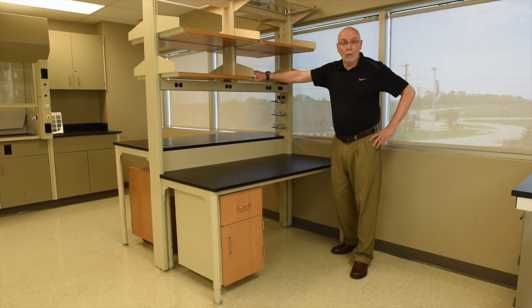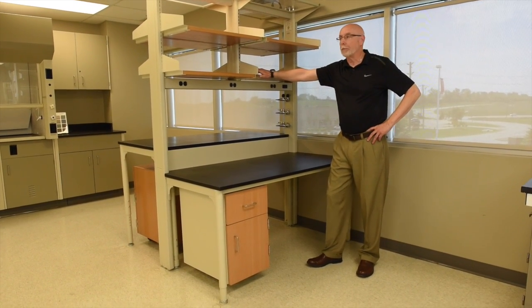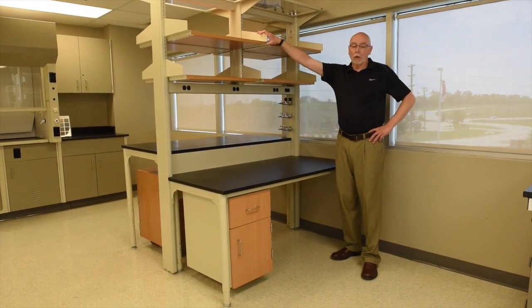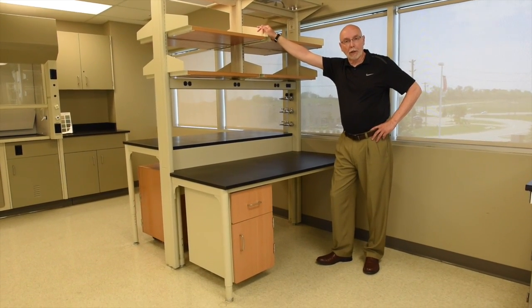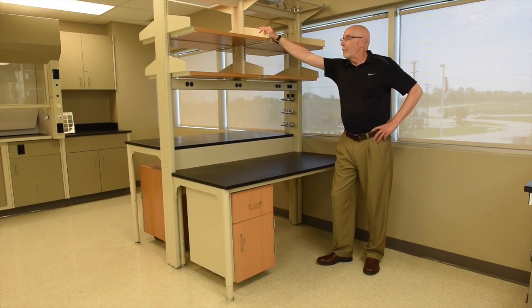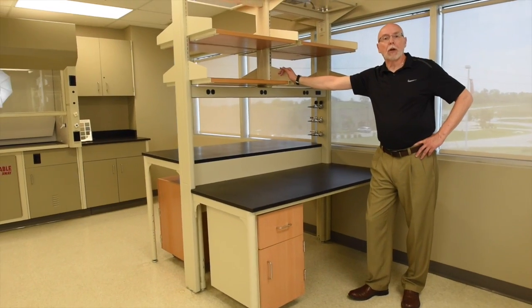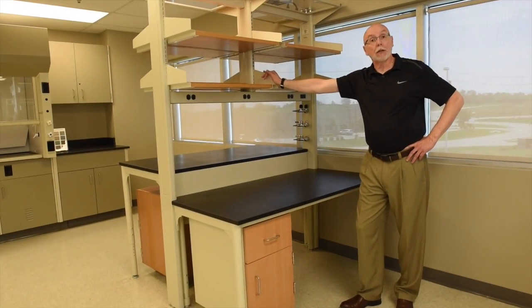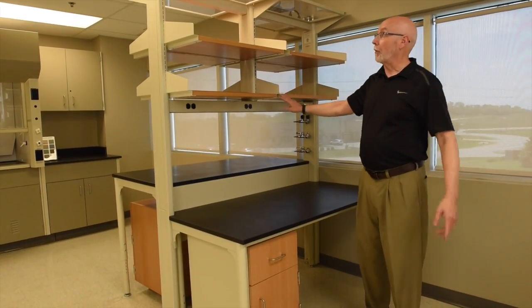Hi, this is Chip Diefendorf. I'm the Director of Business Development for Mott Manufacturing. Welcome to our YouTube channel. We're going to be speaking about our Optima 2550 workbench product here. There are a lot of different versions of this type of solution set in the marketplace. Let's go over some of the details of the Mott 2550.